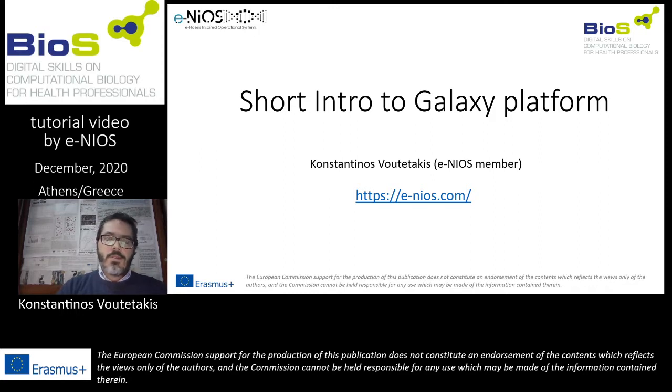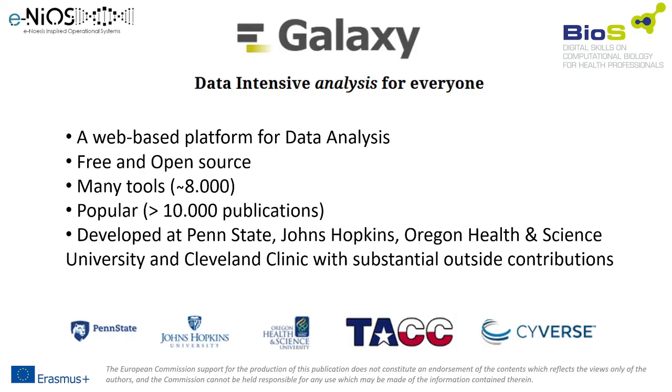This video is a short introduction to Galaxy web platform. But what is Galaxy? Galaxy is an open-source, web-based platform for data analysis. It's easy to use and completely free for everyone. It offers over 8,000 user-friendly analysis tools and is widely used. It currently has over 10,000 publications. It's developed by Penn State, Johns Hopkins, Oregon Health and Science University, and Cleveland Clinic, with substantial outside contributions.